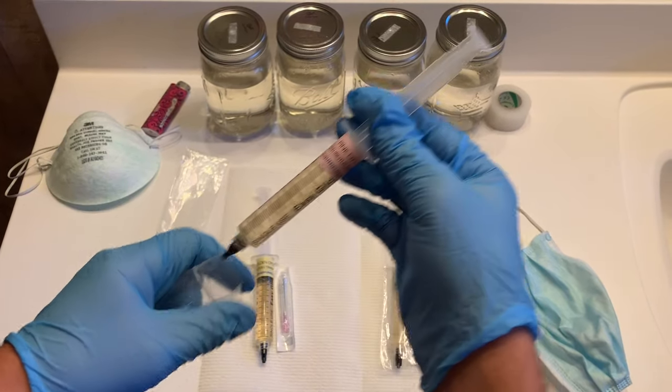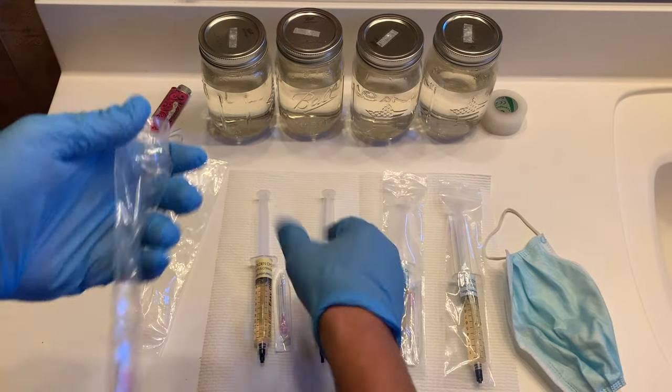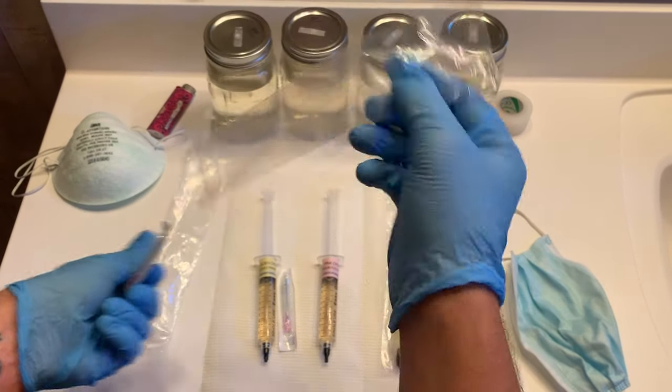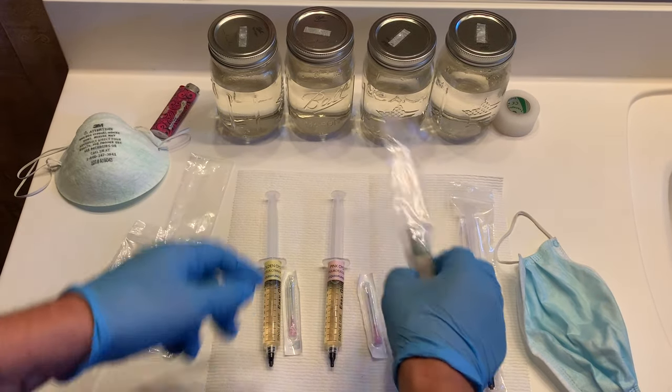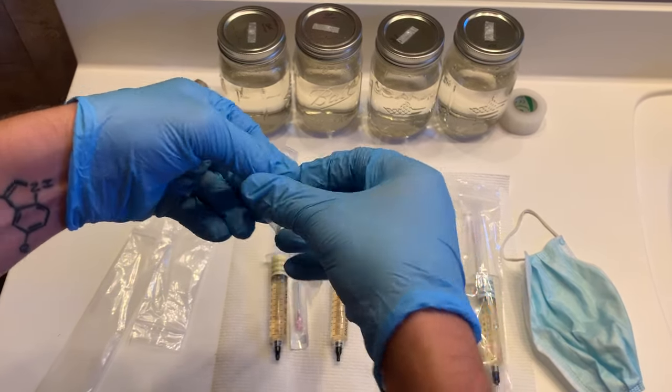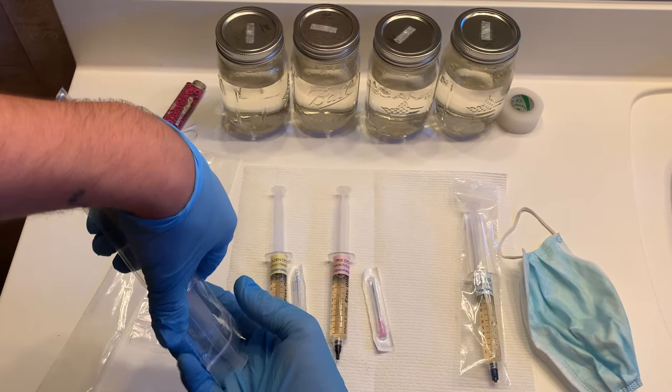Welcome to Spore and Sprout, where I will be documenting and uploading content related to mushroom growing. In today's video I'm going to share with you my technique on how I expand one liquid culture syringe into an unlimited supply of liquid culture syringes.